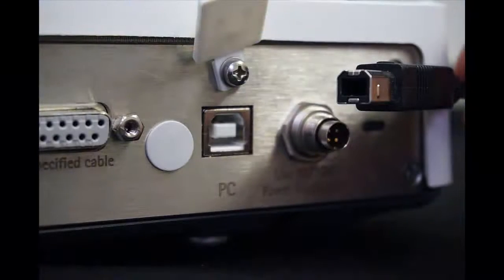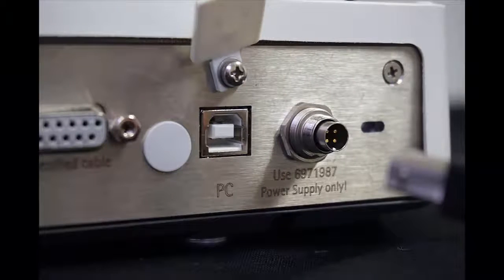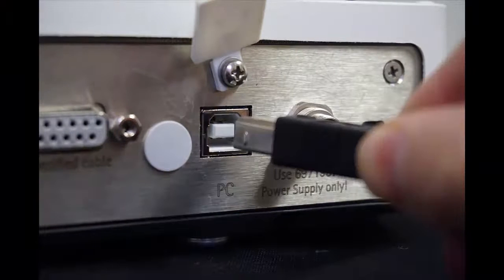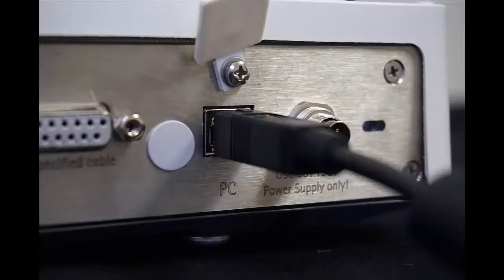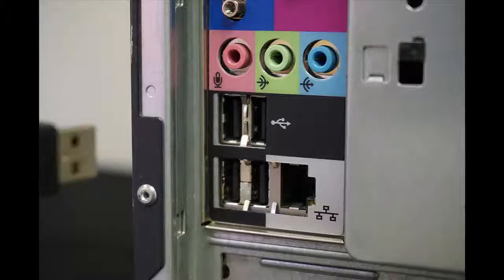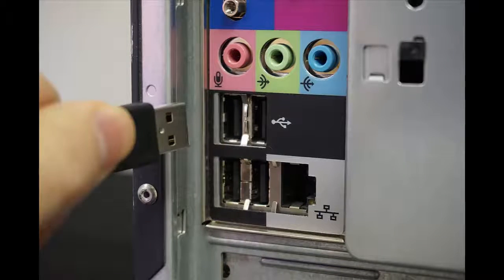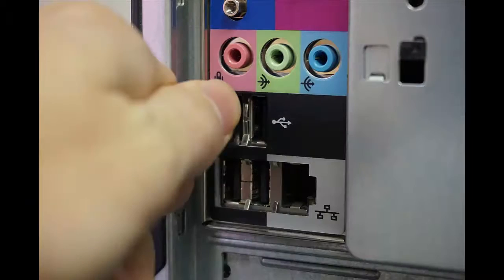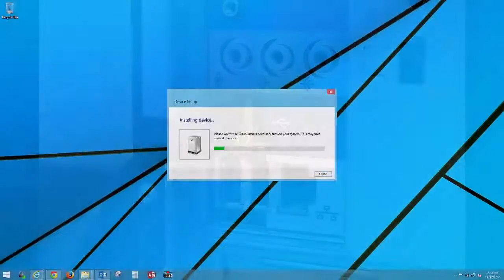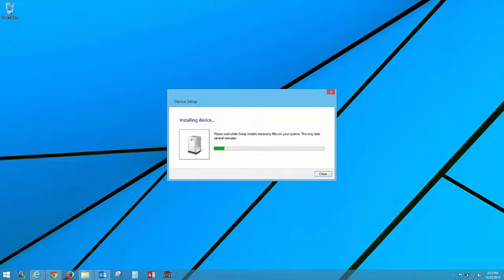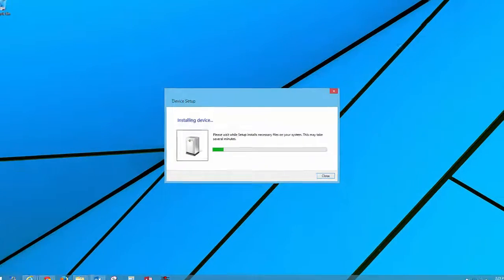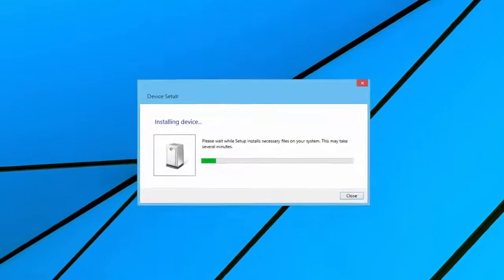Plug the Type B USB connector into the balance and the Type A USB connector into an available slot on your PC. When you connect the balance to your PC for the first time, Windows will attempt to automatically install a device driver for the balance.